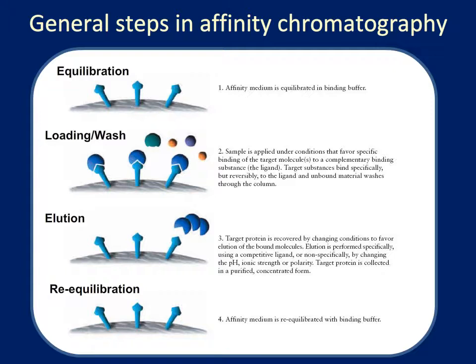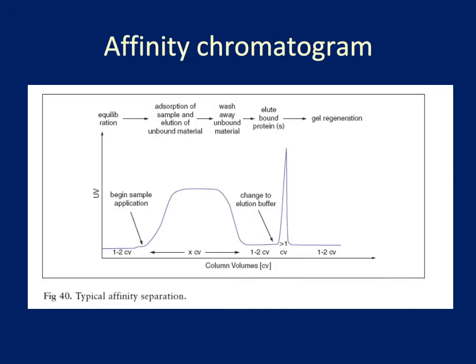Once the protein is eluted, most resins can be reused and should be re-equilibrated for use again. Here's a general chromatogram as would be recorded on an FPLC with the UV 280 absorbance versus column volumes.